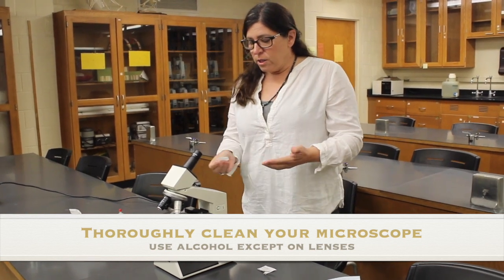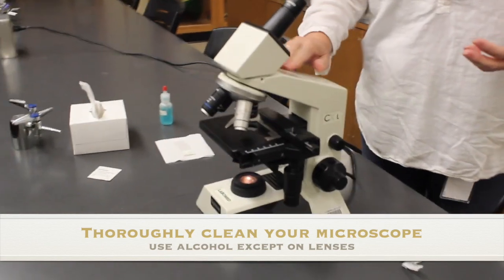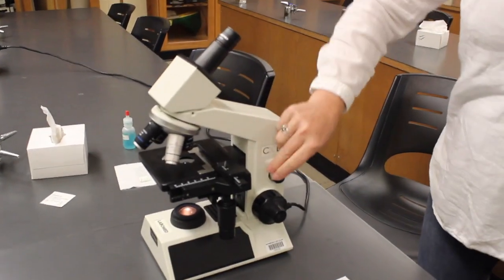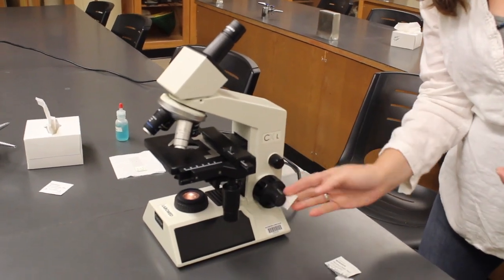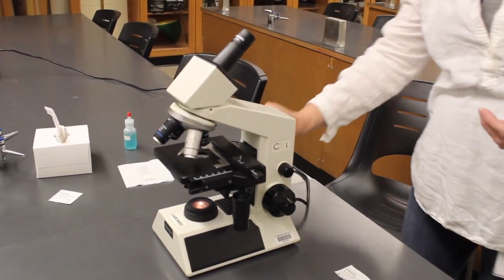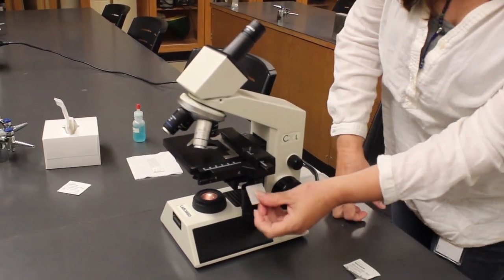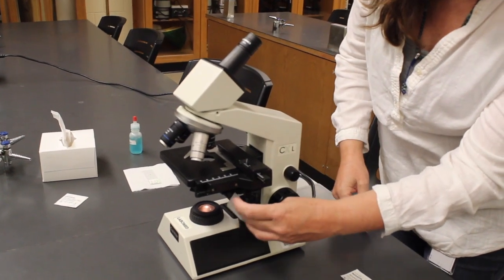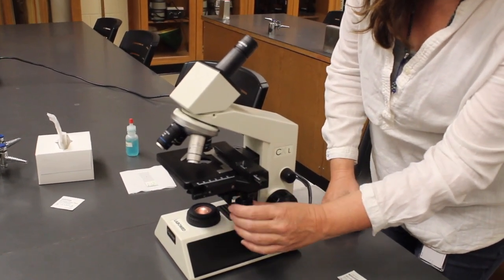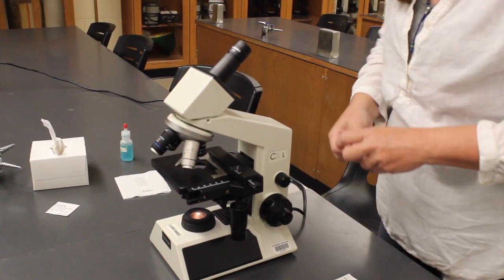The areas that you're going to want to clean on your microscope are the arms, and any place that you might touch, like the coarse and fine focus, which are located on both sides of the microscope. You're also going to want to clean the stage slide movers and get them all the way around because you're going to be touching these knobs in a 360-degree plane.